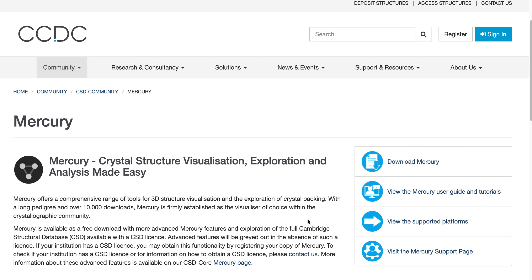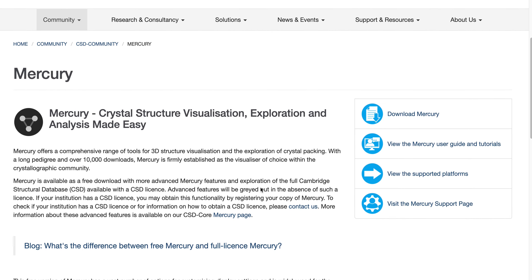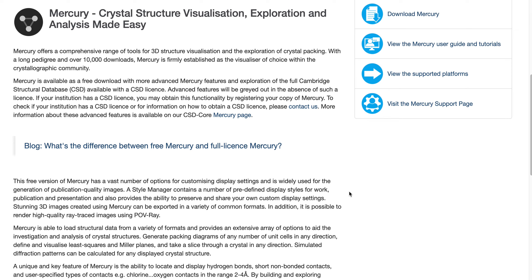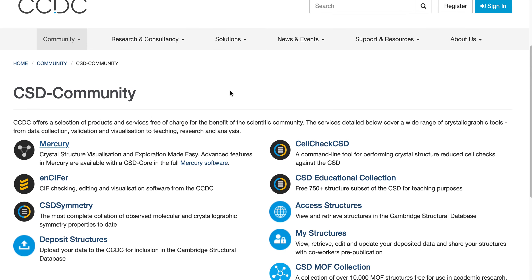Hello everyone. Here I will show you how to install CCDC Mercury for free. In case you don't know what it is, it is a useful tool to visualize 3D crystal structures, and it's integrated with the CSD database, so you can get access to millions of small molecule crystal structures. You can visualize them, manipulate them, and you can have a lot of metadata on the crystal structure as well.